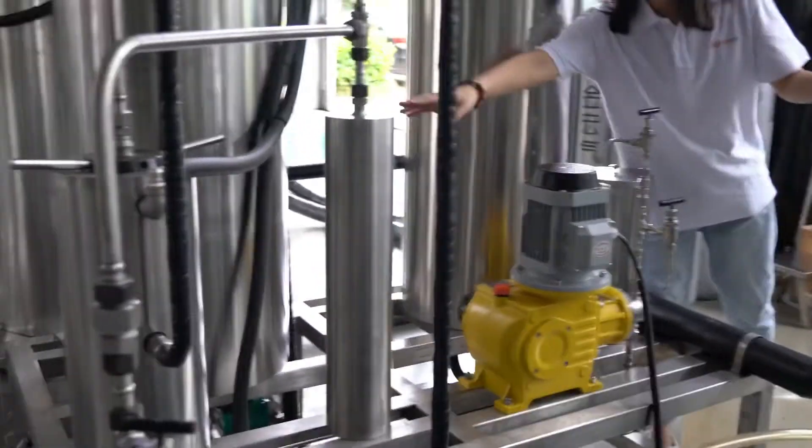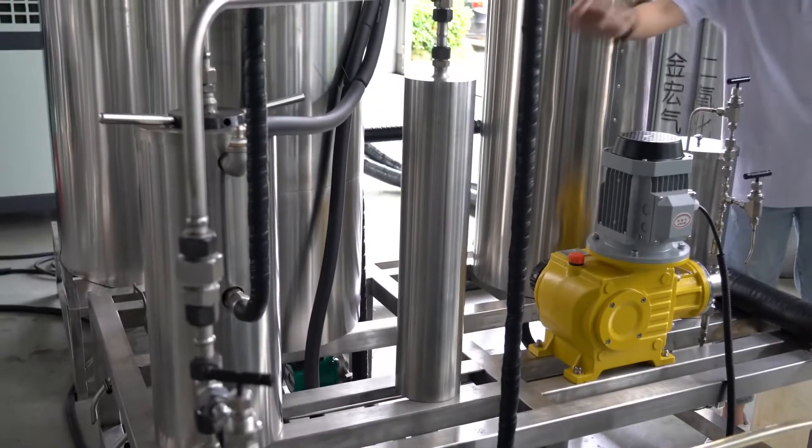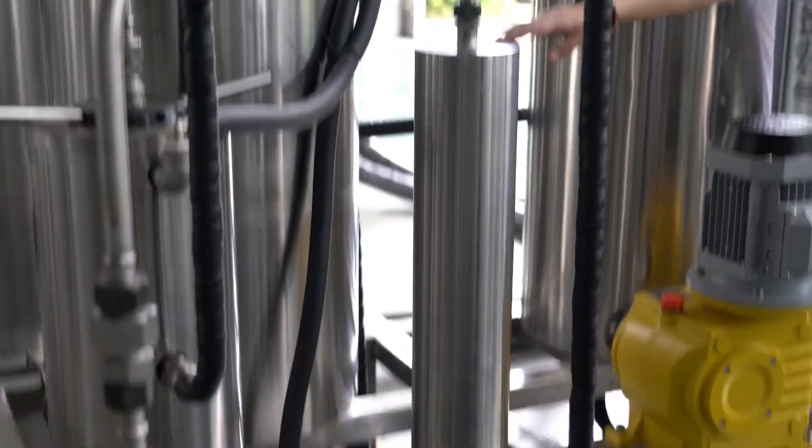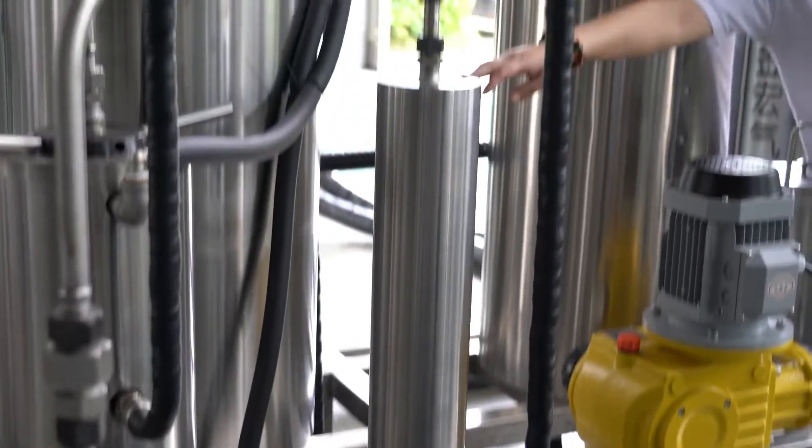The mixer is to the left of the yellow co-solvent pump. Carbon dioxide and the co-solvent will mix together in the mixer before coming into the system.